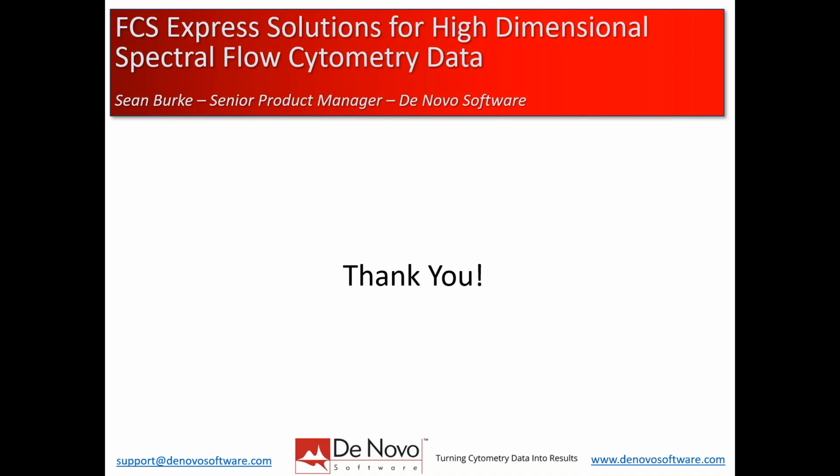Yeah, absolutely. So just as I mentioned, FCS Express looks and feels and works like Excel in a lot of ways. The one thing I didn't show today is all of the functionality. There's t-tests, there's all sorts of comparative tests that you can run, and they work just like Microsoft Excel, right? So if you use the formula in Excel, if you wanted to do an ANOVA, a t-test, pairwise tests, all that functionality is there. As long as you can get the data to the spreadsheet, you can essentially run the tests and you can graph that and report p-values, ANOVA, things like that pretty easily.